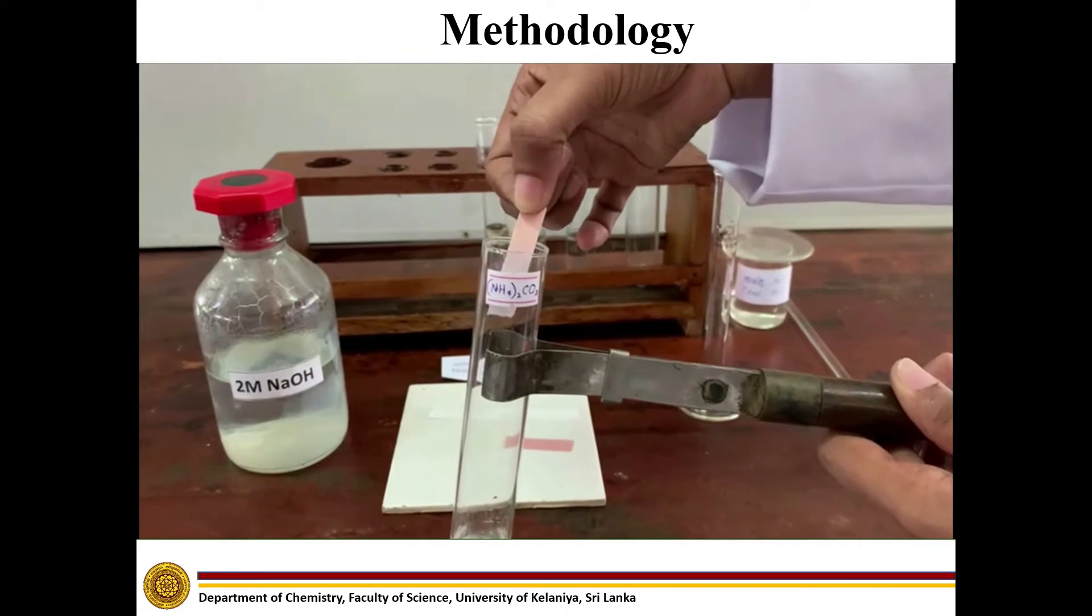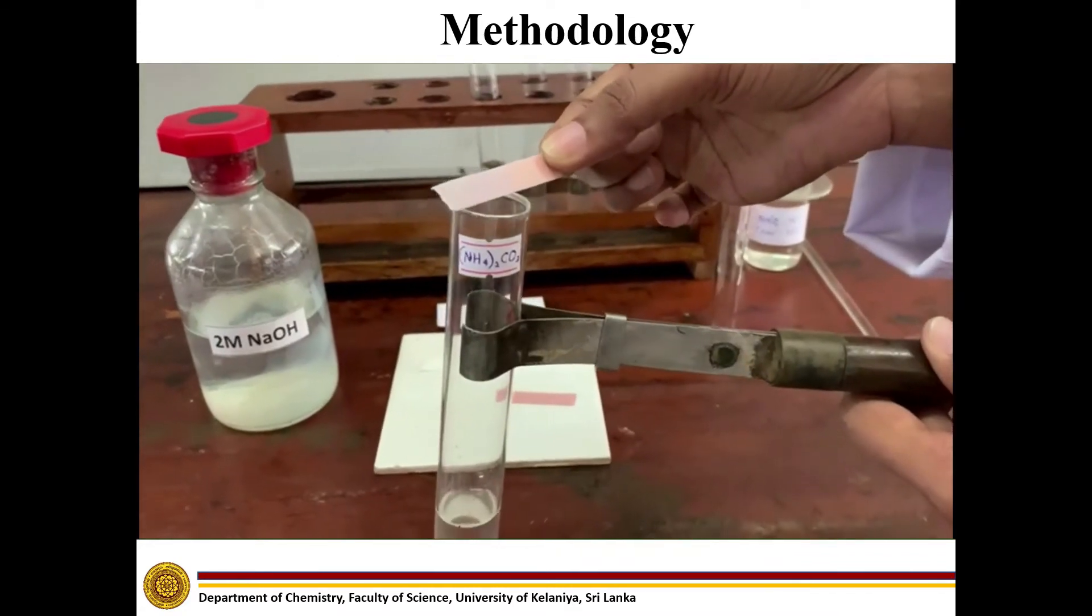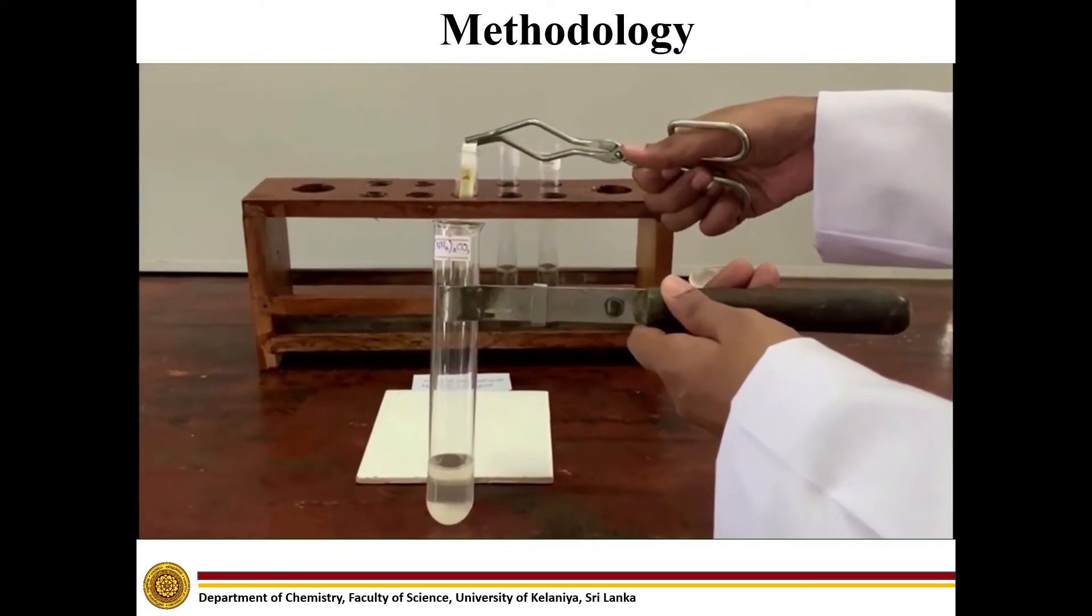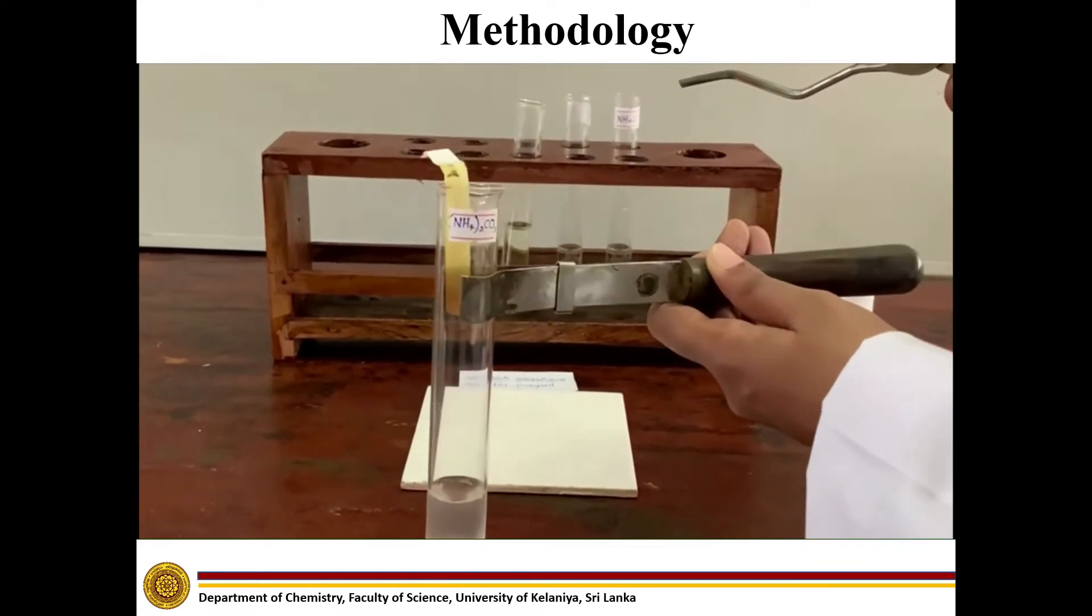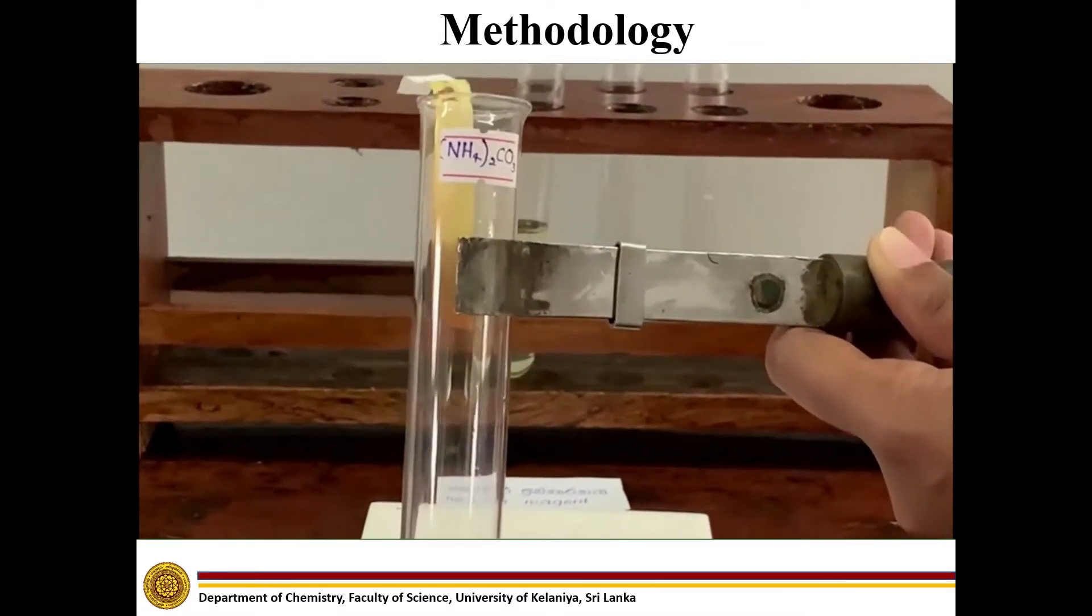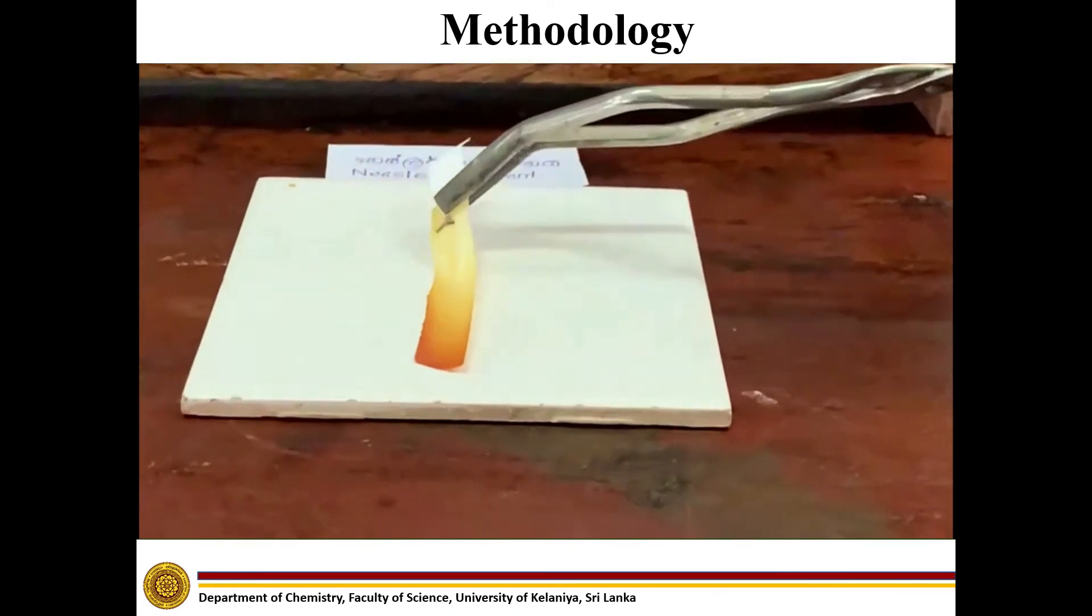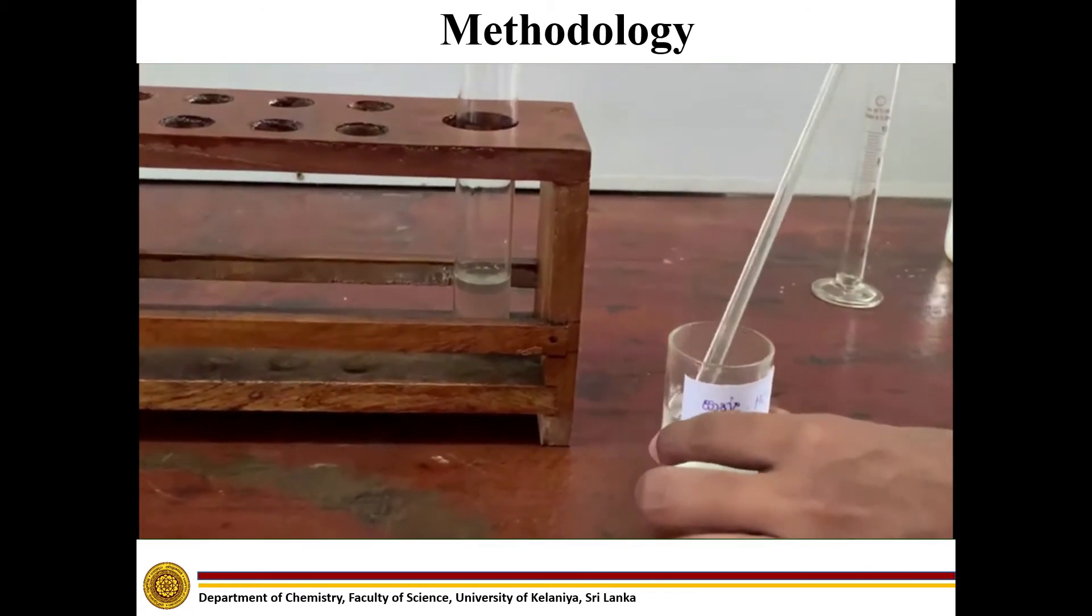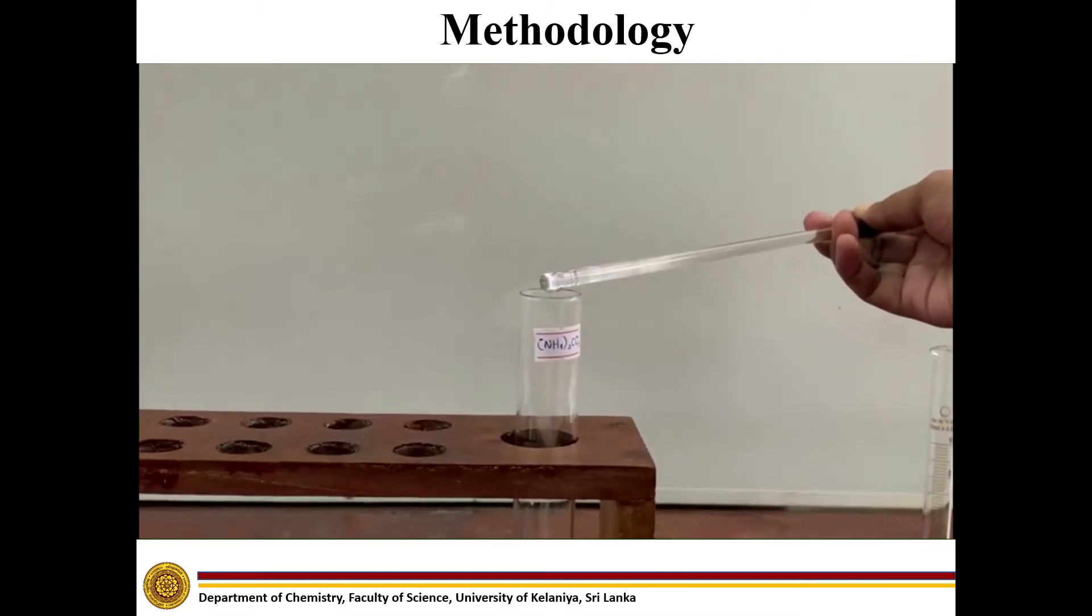Since the evolving gas is ammonia, it turns red litmus into blue. Filter paper dipped in Nessler reagent is turned into brown color. With concentrated HCl, thick white smoke is observed.